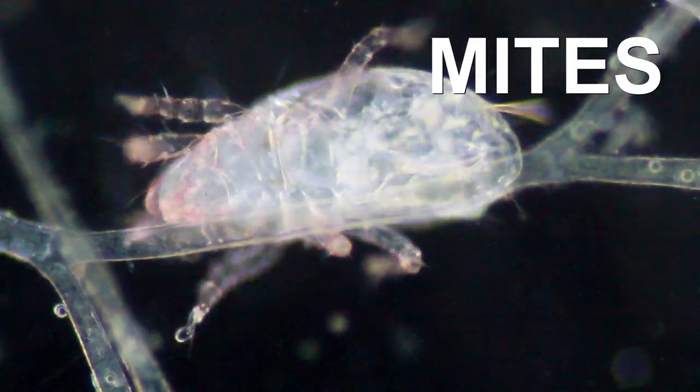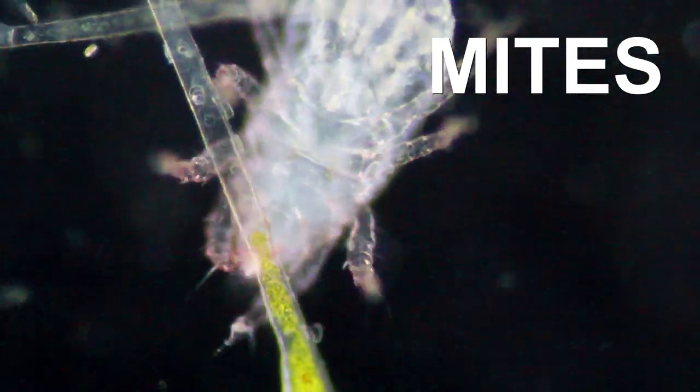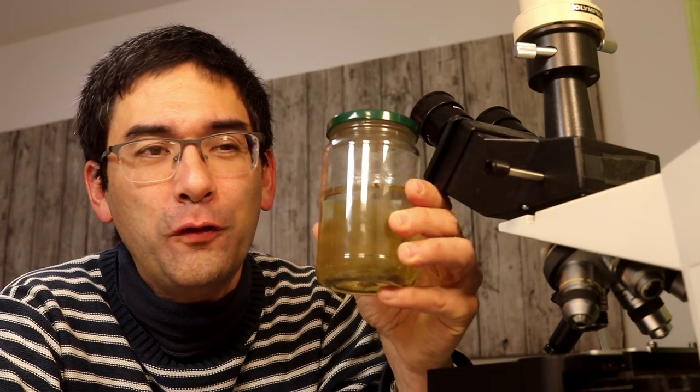Hi, Microp Hunter here, and today I'm going to show you some mites. These are tiny little animals. They have eight legs and they're somewhat related to spiders, even though they're not spiders. And where did I find them? In this jar of pond water.